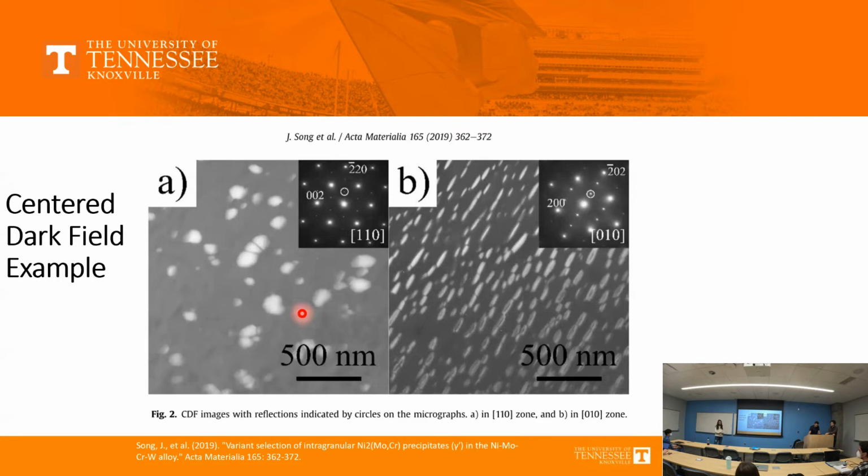Sit on the microscope with me and I'll show you. You move this part, select the g spot, into the dark field. It's so simple: with the objective lens, you just select the g spot. Now in the center dark field, you know one thing, that you can translate your electron beam, right? So in the center dark field, you are bringing your g spot to the center of the beam. Any comments? How would it change your analysis?